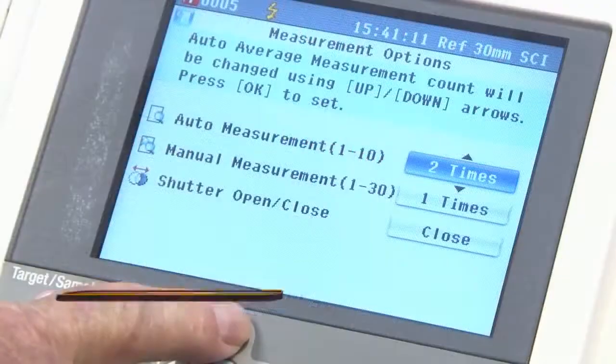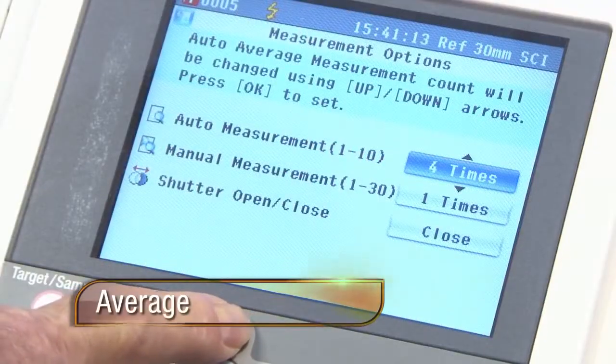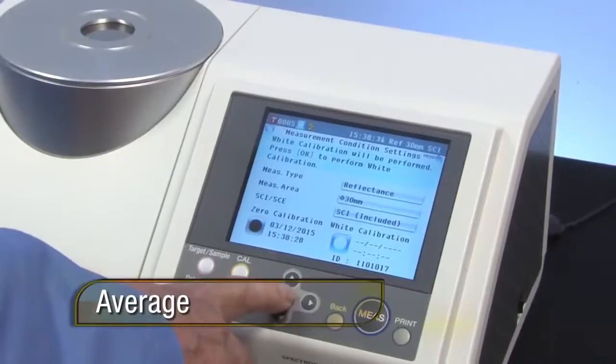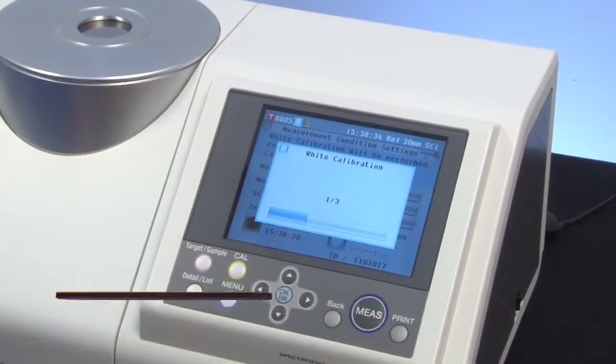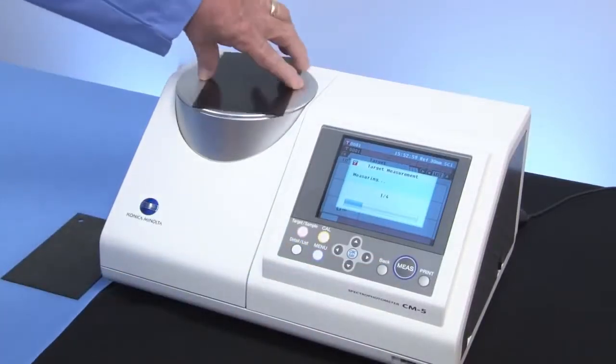The CM5 has an average measurement mode for textured materials. Calibrate, set the auto measurement, turn the sample while automatic measurements are being taken. This setting is also used with color difference.